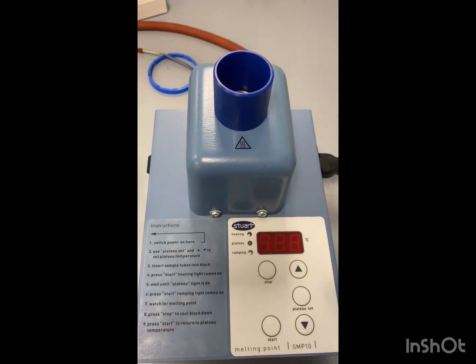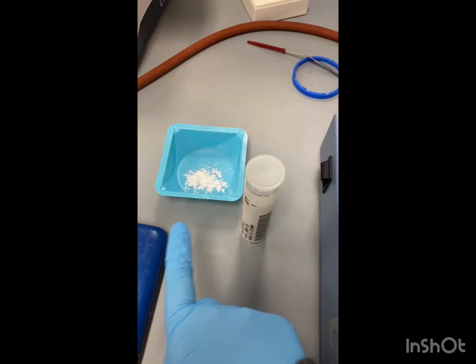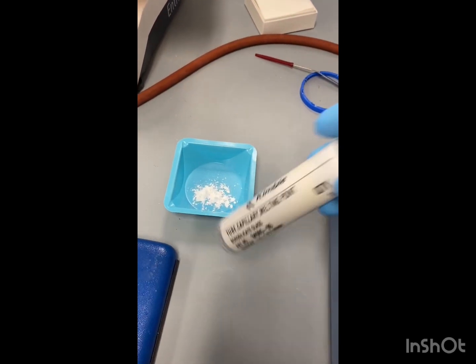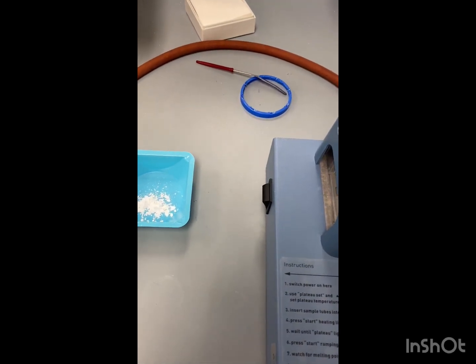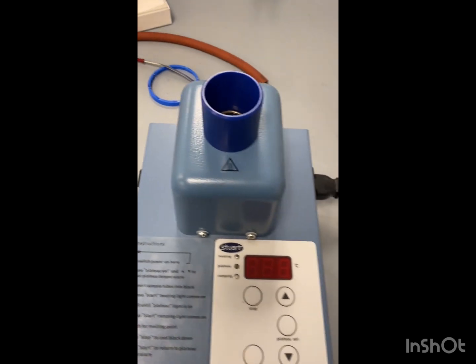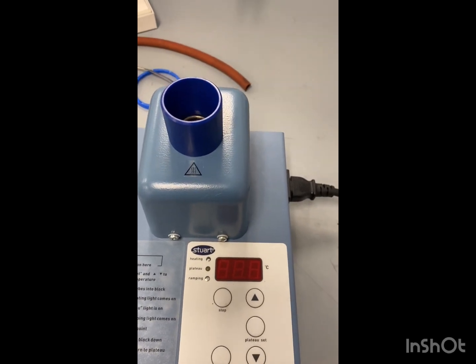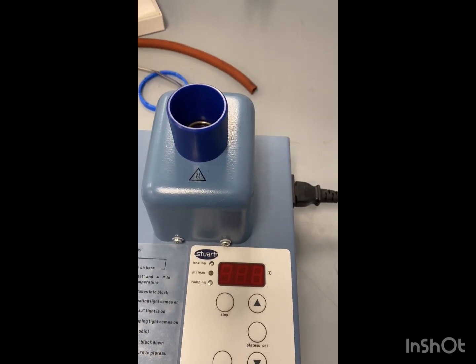All right, so here's our melting point apparatus. Here's our solid and here are some melting point capillary tubes. So we're going to get our product in the tube and then we're going to get a melting point range on our solid.